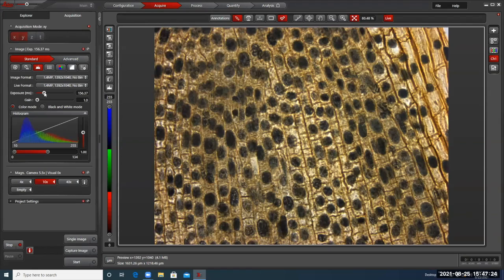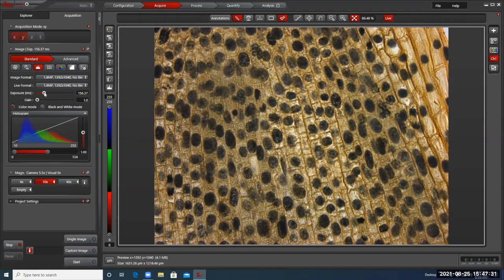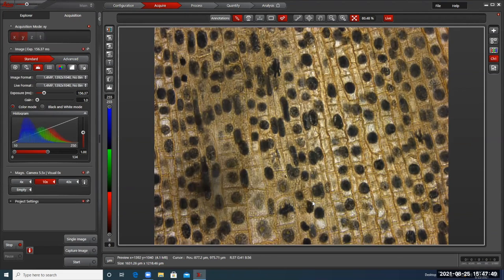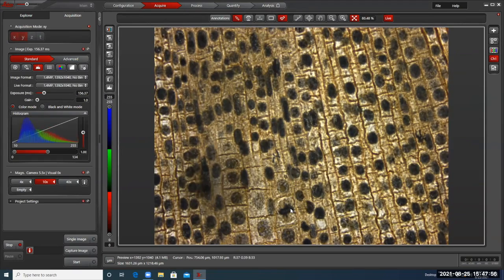I'm not seeing too many different phases here. Let's see. I want the ones where, oh yeah, right up here, there's something where you're seeing all the various ones. There's some here. So look for a place that has these interesting chromosomes so you can take an interesting picture. This one's a good one. So you've got chromosomes here doing something interesting. Let me focus in on that a little more. And you've got interesting chromosomes over here and here.